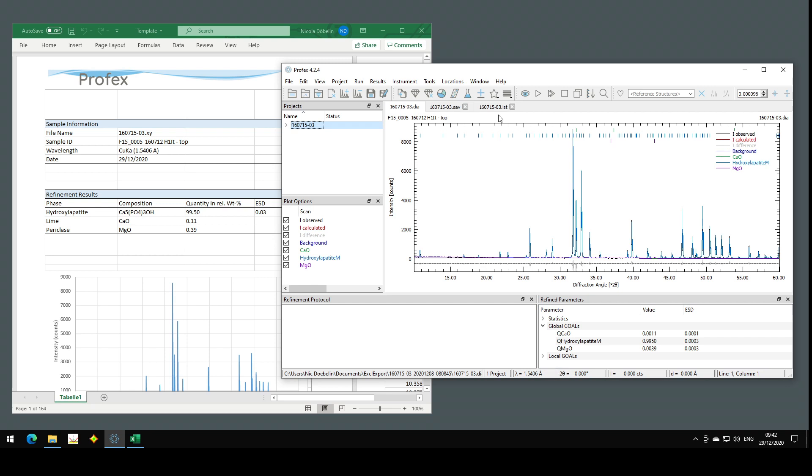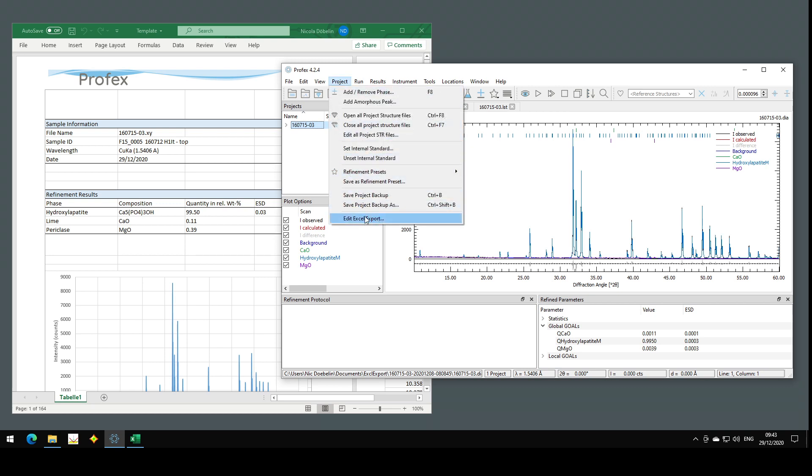But before we begin, I have to apologize to Mac and Linux users. This feature is only available on Windows, because it is using some functions built into Windows to communicate with Excel. So this does not work on Mac OS and Linux, and you will not even find the relevant menu entries. They are hidden on the platforms where this feature is not available.